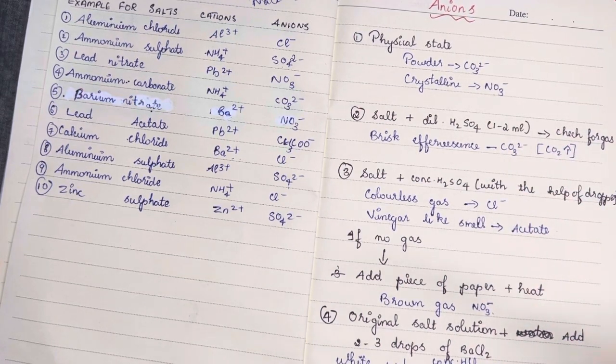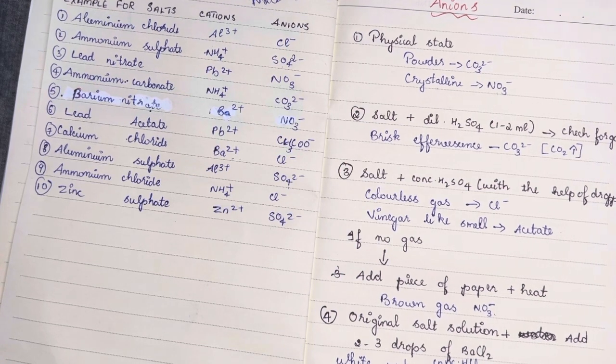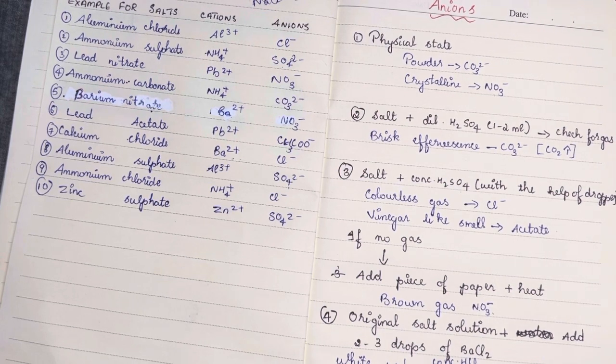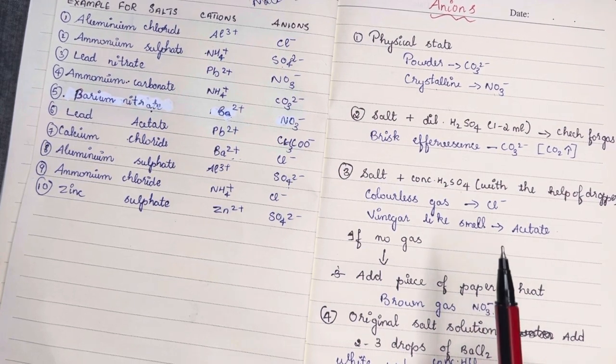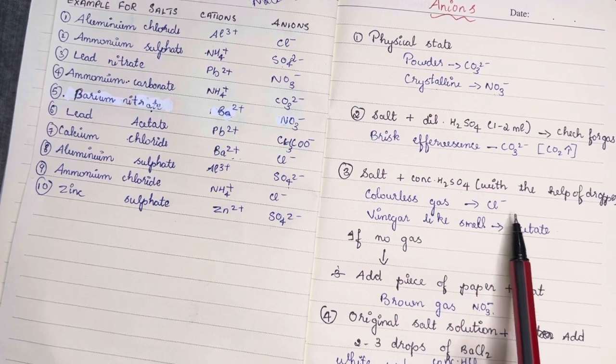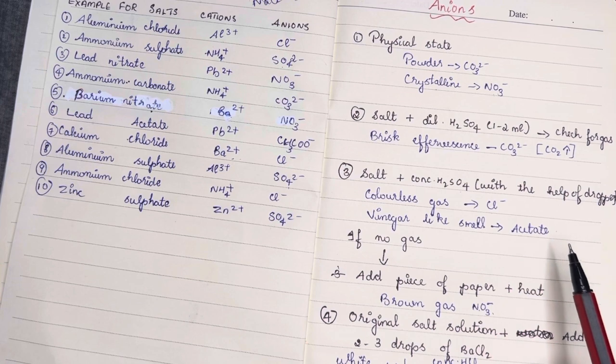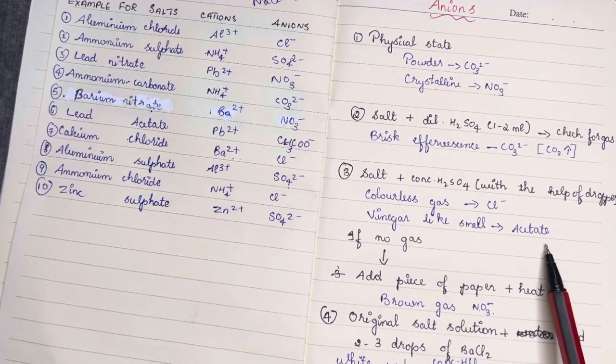You can then make out which anion is present, and after that you have to do the confirmatory test for each of these anions. If carbonate is present, you have to do the confirmatory test for carbonate. If you see the colorless gas, it means chloride ion, so you have to do the confirmatory test for chloride. Vinegar-like smell means you have to do the confirmatory test for acetate.